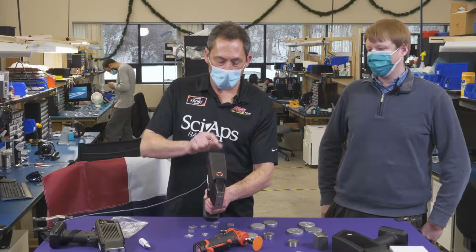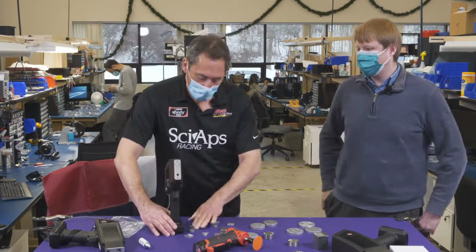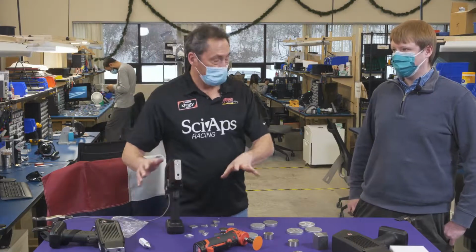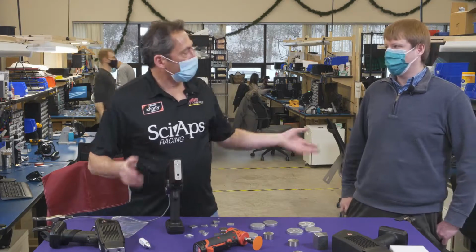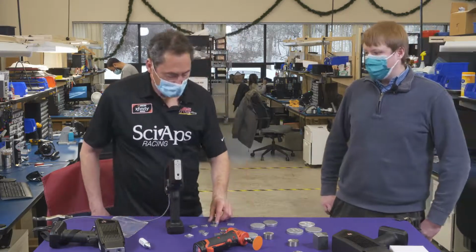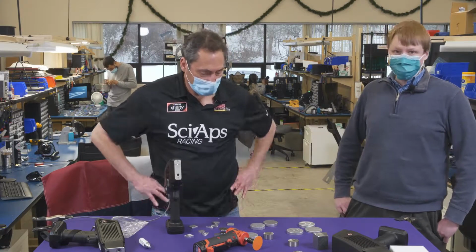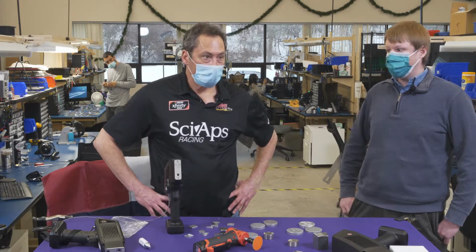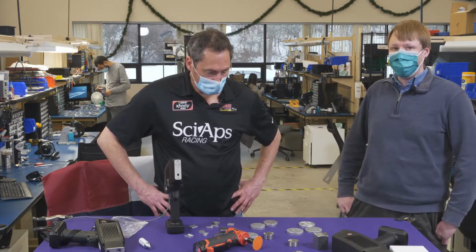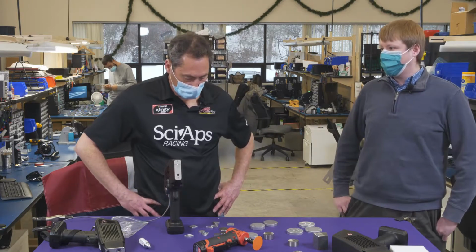Let's go over to the argon purge version, what we call alloy. So tell me about that. Can you give me a couple reasons why you might want to use argon, given how well we just did in air? Yeah, so with argon, you're going to boost your signal a lot, and that's going to give you better repeatability, especially on really low concentration stuff. So trace level, argon is going to help you. And some of the percent level stuff in the more challenging bases like nickel, stainless steels, argon's going to help you with that too.